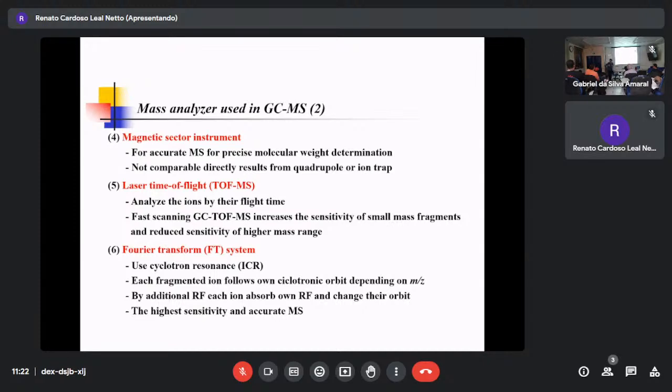All the charged material in the magnet has its own frequency. Right? That's the rule of nature. I didn't make it, God made it. All the ionized ones, like protons. Protons in NMR, in the magnet, absorb frequency. And also ions in FT-MS.